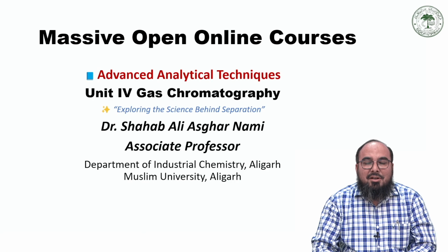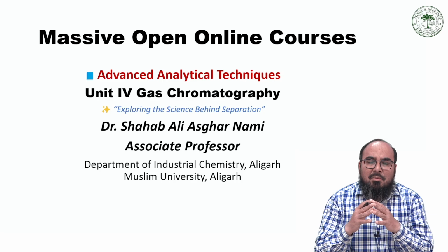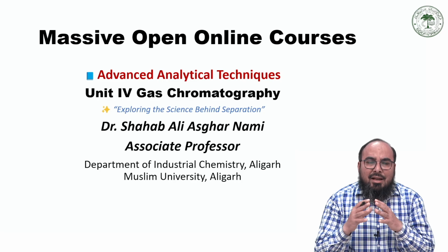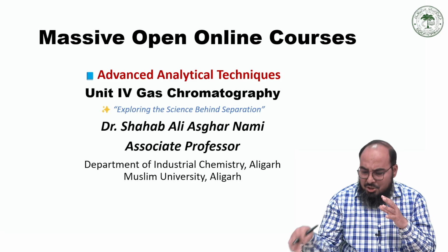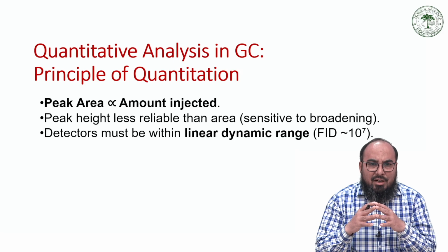Hello students, after the interpretation of the gas chromatogram, now let us see how this gas chromatogram actually helps us in getting the quantitative idea of various components present in the vaporized sample. So let us begin our journey with regard to quantitative analysis in gas chromatography.